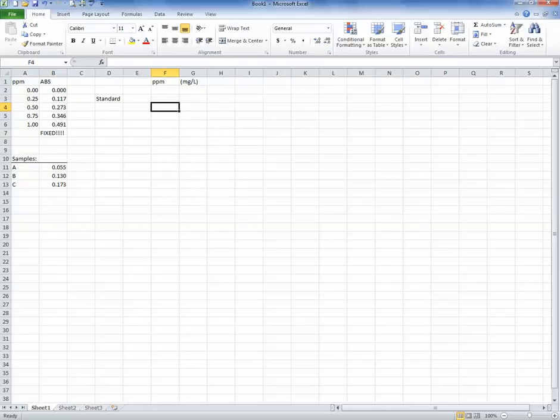So I'm going to write that over here to the side. I'm going to scan it first, and this gives me the wavelength that I need. I then go to the fixed. I make the instrument go to, that's what we call that, go to the wavelength that we just determined, and then I analyze my standards and I analyze my samples at that one specific number. We talked about that in the previous video, right?